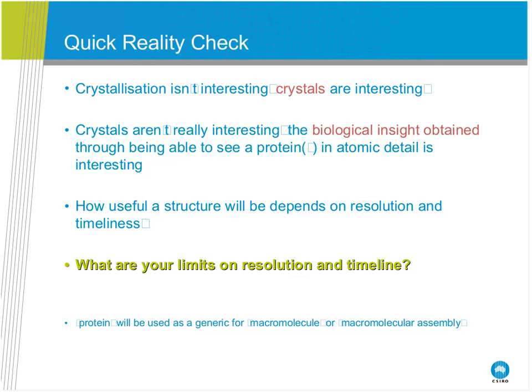And then if we move on, given that we have the equipment, we have the background, one of the things that I wanted to point out, and one of the things we've learned, is that crystallization is generally not interesting. In fact, I would say of my 150 users, about none of them are interested in crystallization. What they're interested in is crystals. And then actually, if you push that even harder, they're not actually interested in crystals at all. What they're interested in is the biological information that you get from shooting X-rays through crystals.